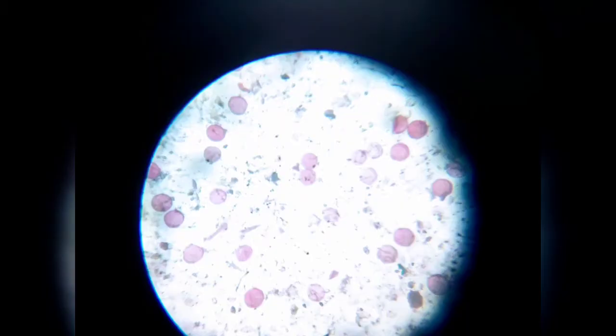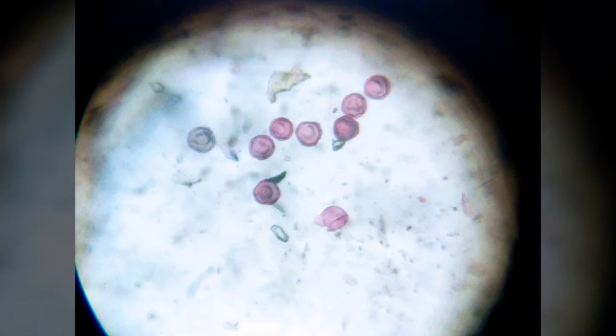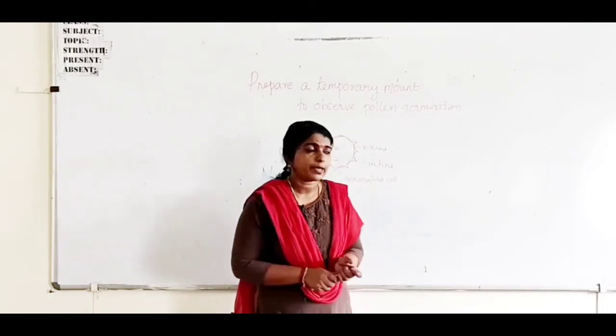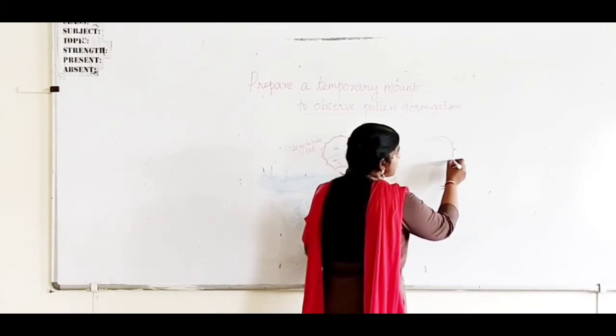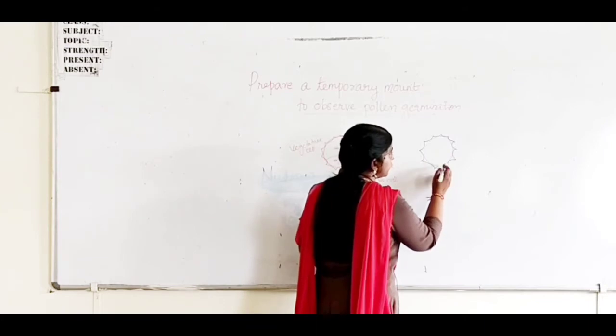In this way you can see the pollen grains through the microscope. Some of the pollen grains start to develop the pollen tube, which you can observe through the microscope. Some pollen grains start to germinate. During pollen germination, the pollen tube develops and comes out through one of the germ pores.